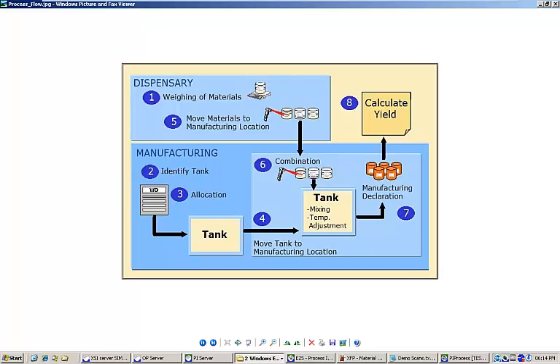In the previous segment, I demonstrated XFP's built-in weighing functionality and weighed all of the materials required for my work order. In this segment, I will continue and complete execution of the EBR.